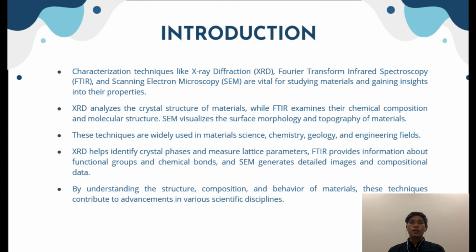Additionally, XRD analyzes the crystal structure of material, while FTIR examines their chemical composition and molecular structure. Meanwhile, SEM visualizes the surface morphology and topography of materials. These techniques are widely used in material science, chemistry, geology, and engineering fields.